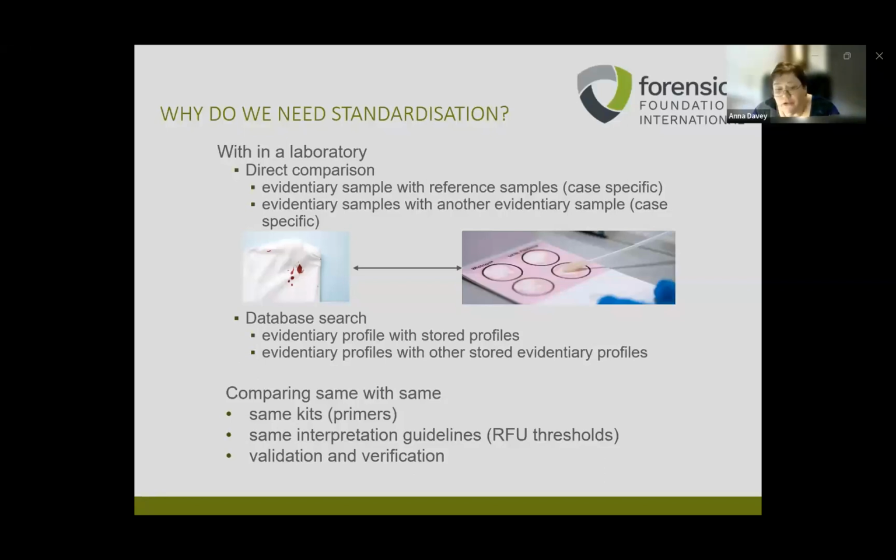Again, you might want to compare an evidentiary profile with other stored evidentiary profiles. It could be that it has not been recognized that it's the same person who has been involved, but you can actually do that by linking evidentiary profiles in the database. Because it's being done within one organization, you are basically comparing same with same.